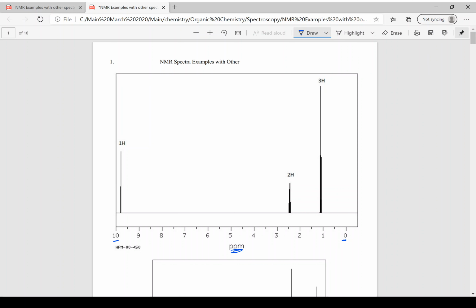Now the first thing you should do is label how many peaks you have, and I tend to use lowercase letters, so a, b, and c. So there are 3 peaks, which means there are 3 unique types of hydrogens. I usually make a little note to myself right here in the top corner. Then I count how many hydrogens they integrate for: 3, 4, 5, 6. So there are 6 hydrogens. And remember, even numbers of hydrogens mean there are no halogens and no nitrogen. So already I know a lot of information from there.